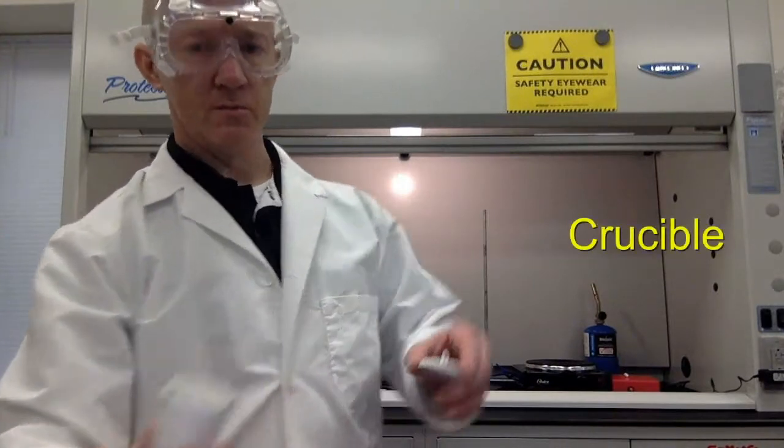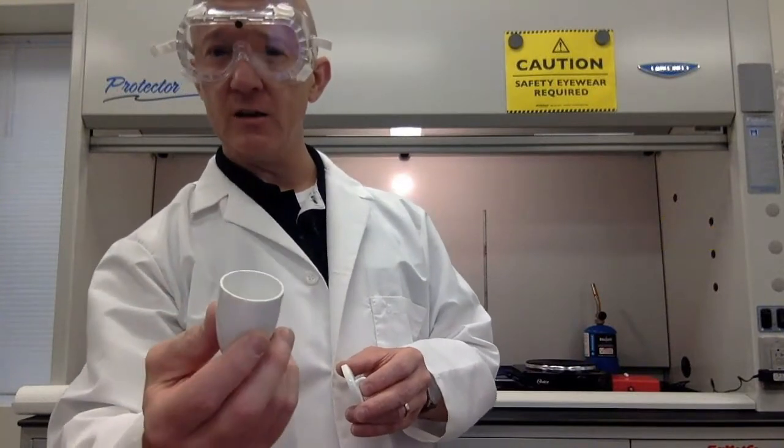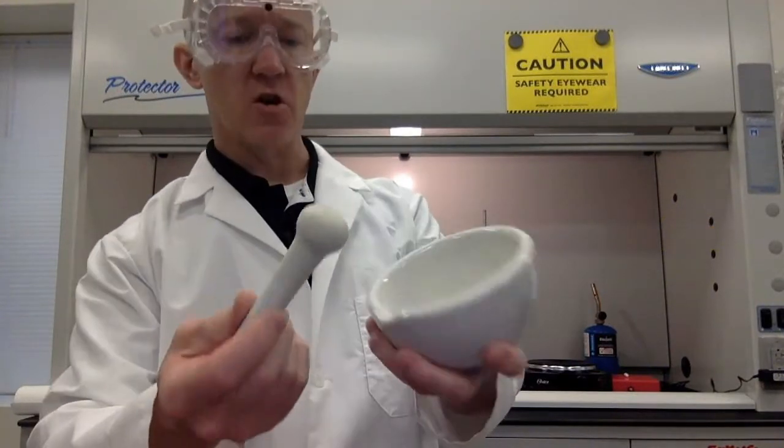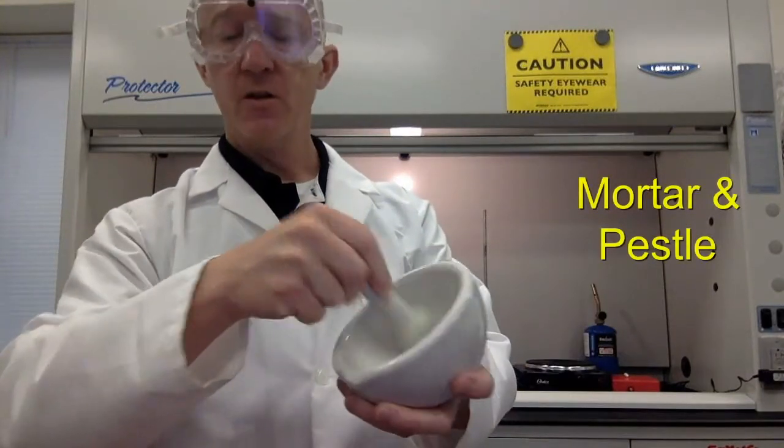This is called a crucible. Here's a lid for it. A crucible is used when you have something that needs to be more intensively heated. Say with a torch. This is called a mortar and pestle. This is used for taking solids that need to be crushed into powder.